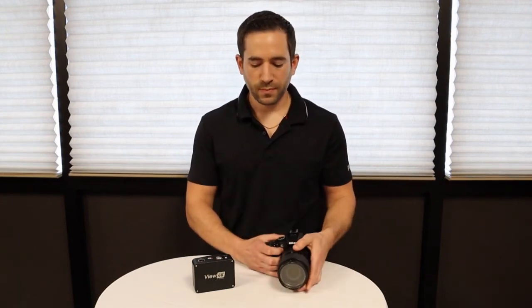Second is adjusting your camera settings. It's not very easy to adjust your camera settings to white balance or adjust the exposure prior to taking your image. Lastly is viewing the final result. You typically cannot easily access your images until you take the SD card out of your camera and move it to your computer. You may not be happy with your images after you see them.